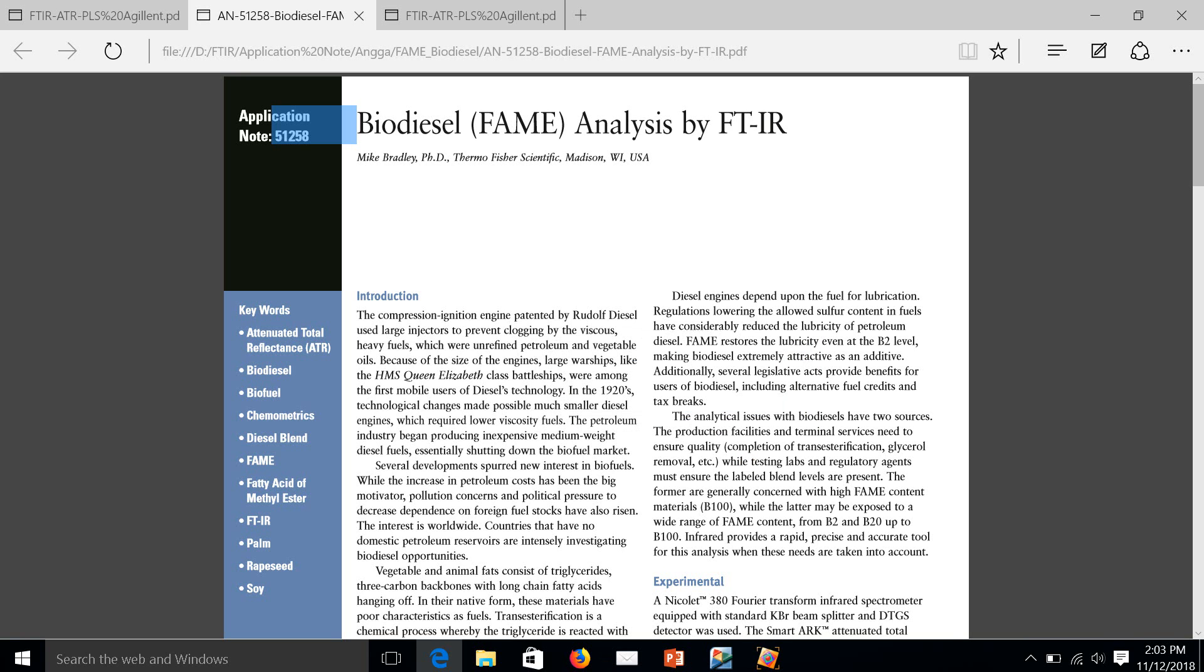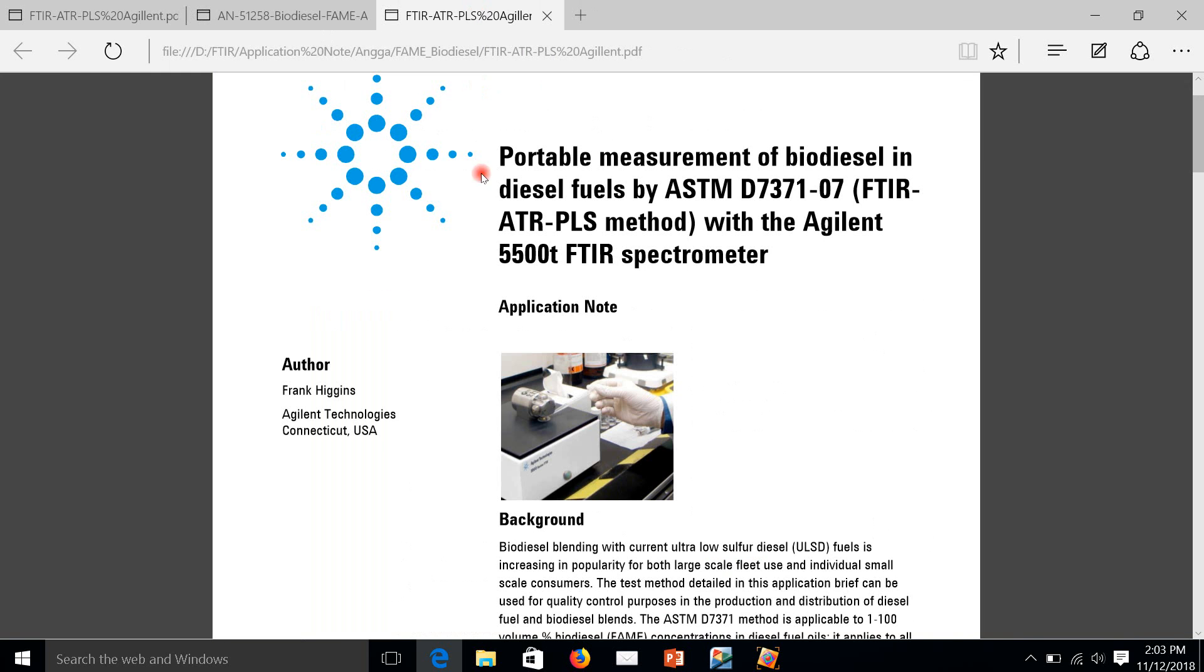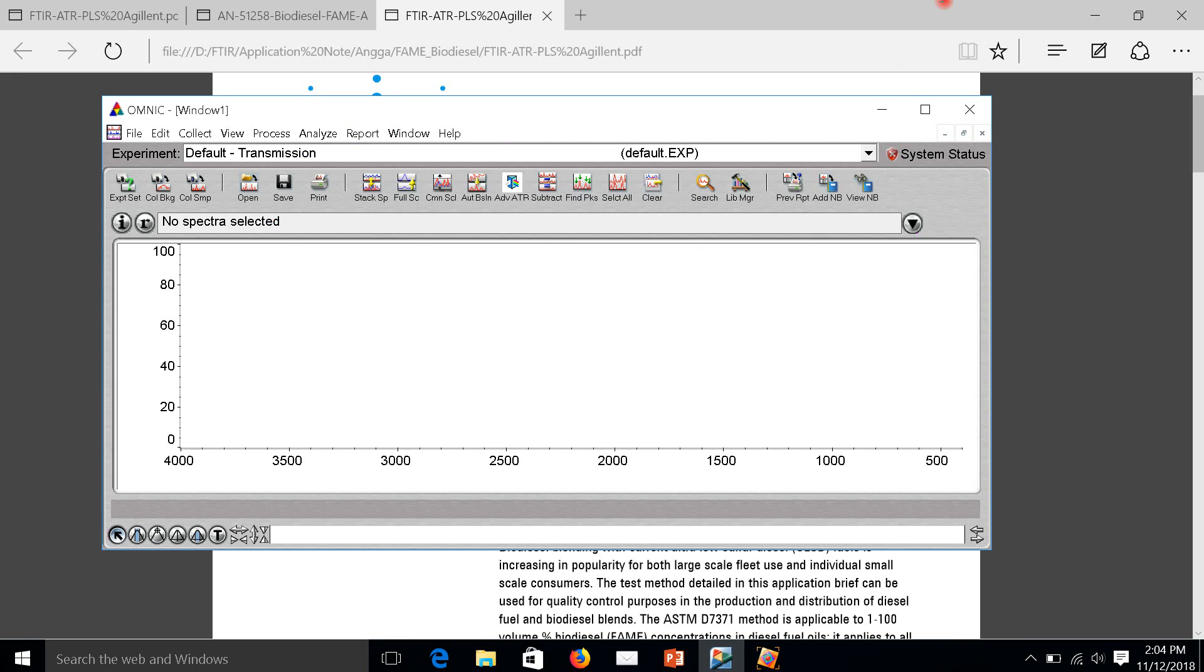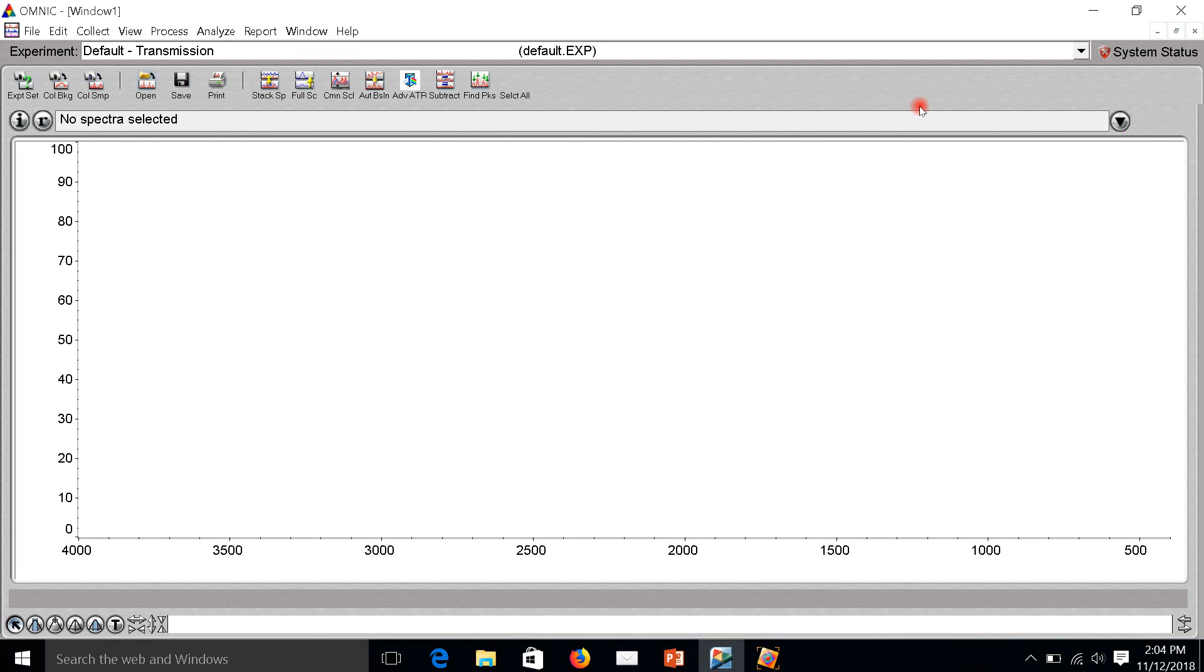This one is coming from Thermoscientific, the same method using ATR and PLS method. I believe all manufacturers of FTIR have this application. Now I will show you the spectrum that I already scanned with my FTIR.